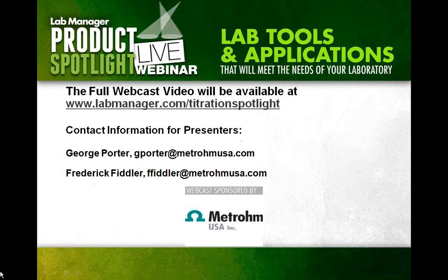That's a good point. The next question is, we see a drift of our standards or factors after a few hours of non-use. For instance, we run the factor and standards and then an unknown, and then another unknown after 3 hours, and we see that the same standards actually have a higher value than before. So what do you think is the cause of all this?